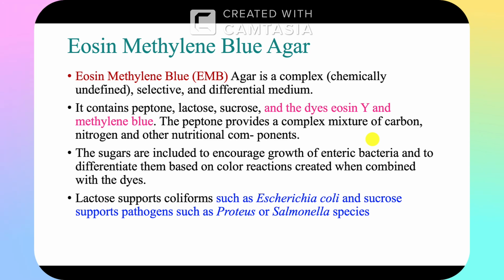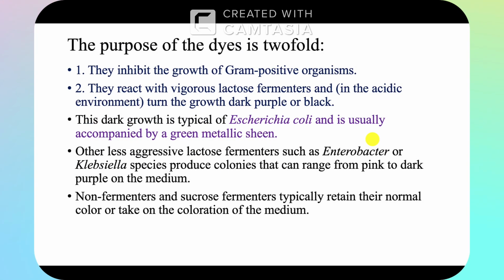If you remember, we have lactose fermenters and non-lactose fermenters. E. coli and Klebsiella are lactose fermenters, and the others like Salmonella and Shigella are non-lactose fermenters.